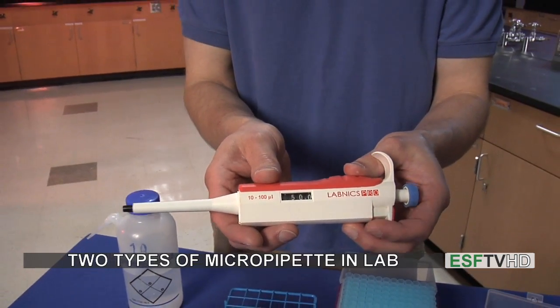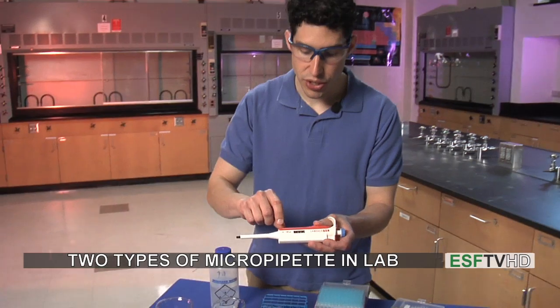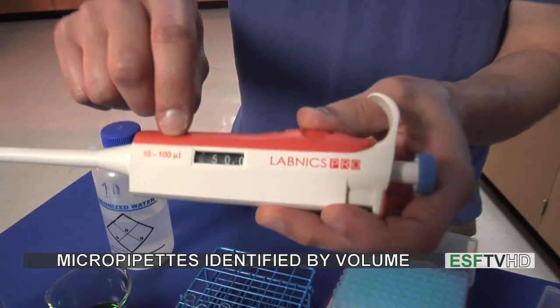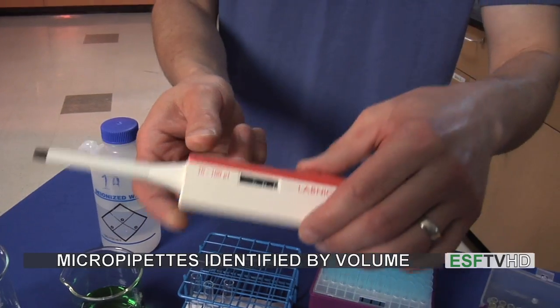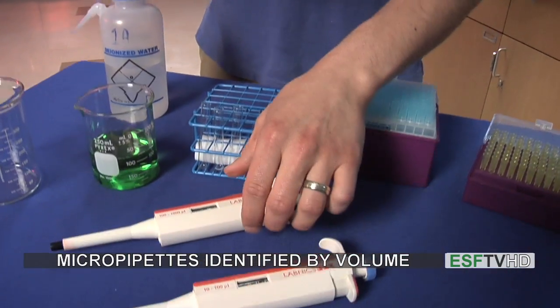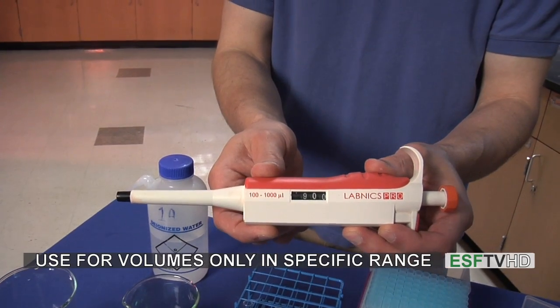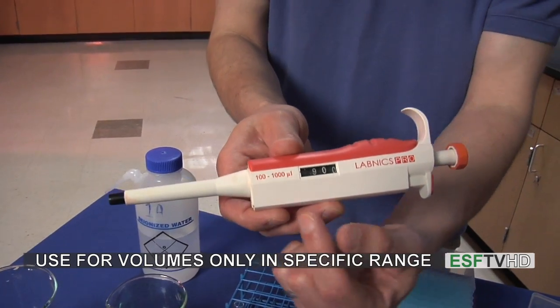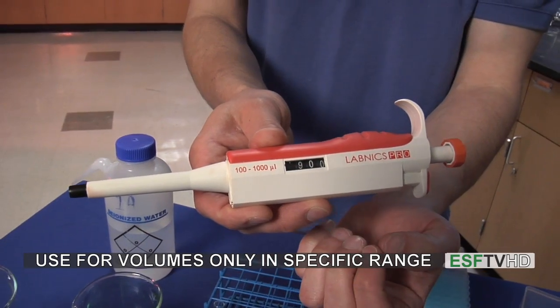We have two types of micropipettes in the lab, listed by the volumes that they can measure out. We have one that measures from 10 to 100 microliters, for very, very small volumes. We also have another micropipette which measures 100 to 1,000 microliters. They both function in the same way. We never want to go beyond the range of the micropipette.